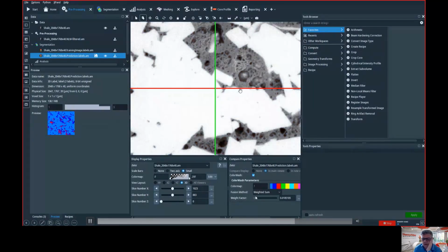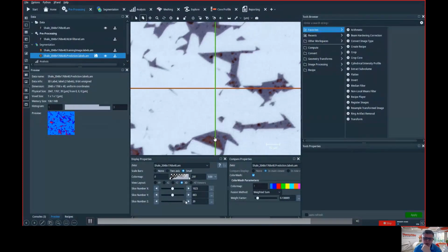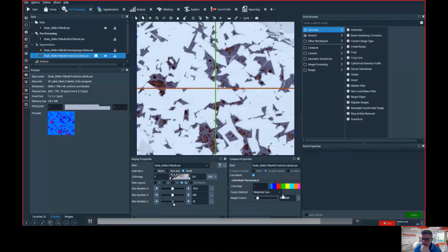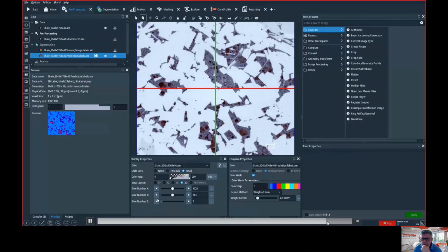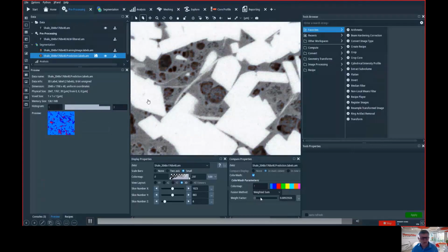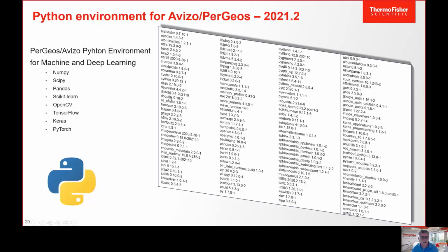So this is the result that is quite good. Maybe it's not perfect, the code is not perfect, but you can get this code for free. So, but I think it's a nice place to start if you want to do this sort of thing. So I go next. Yeah, so this is the library.